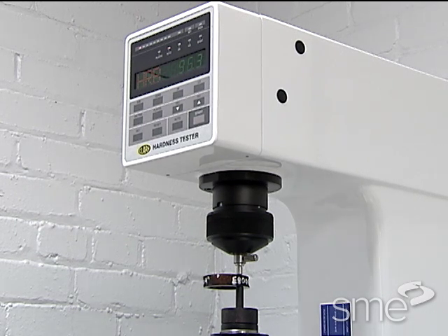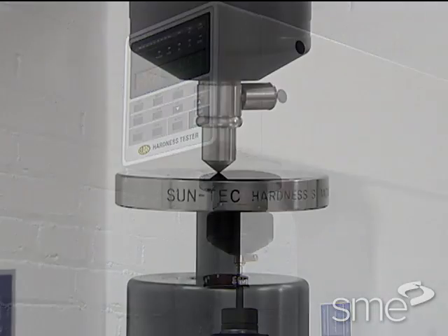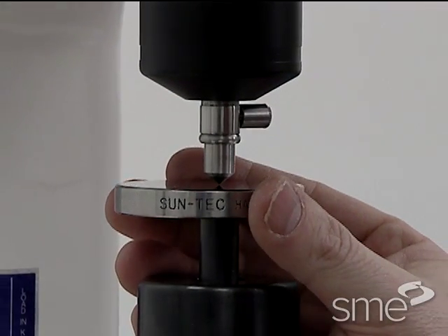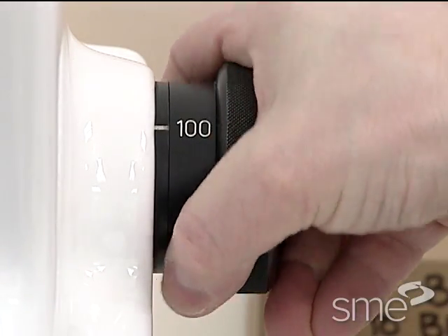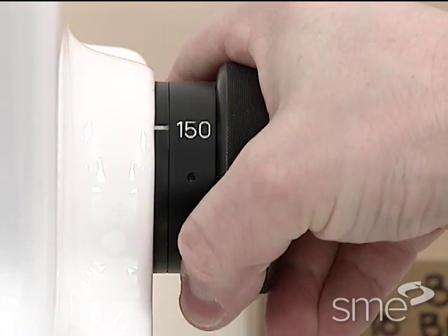The harder the material, the higher the number. The minor load applied is always 10 kilograms, and the major load may be 60, 100, or 150 kilograms.